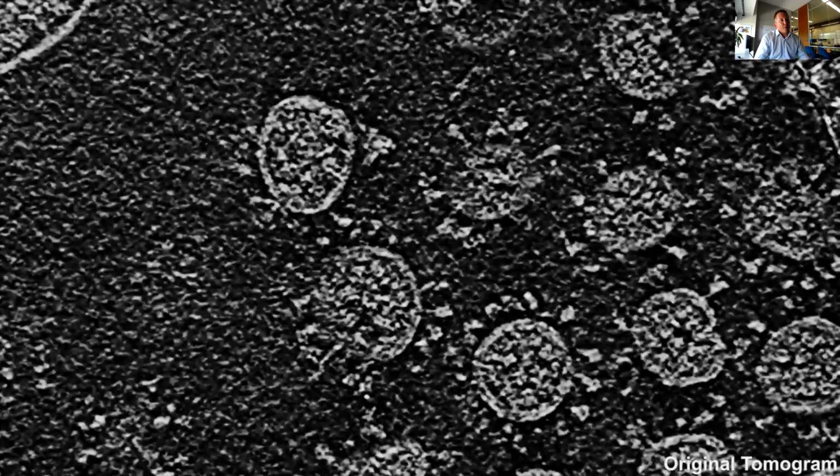But already we sort of realized that maybe now is the time where the resolution of the microscopy is so good that we can actually generate atomistic models or relate atomistic models with the microscopic experiments or with the microscopic acquisitions, and started to look more deeply at what technological standpoint we have in terms of visualization of cryo-electron tomography data.